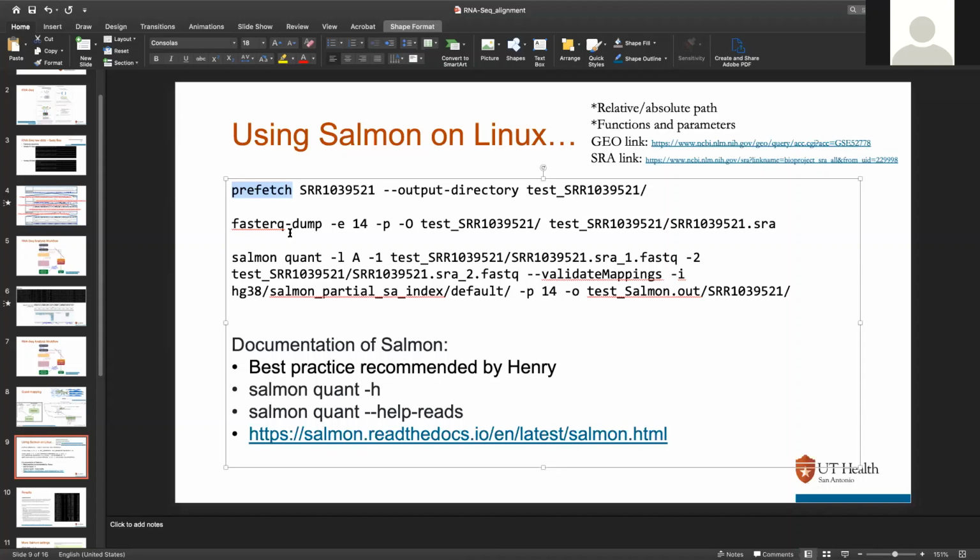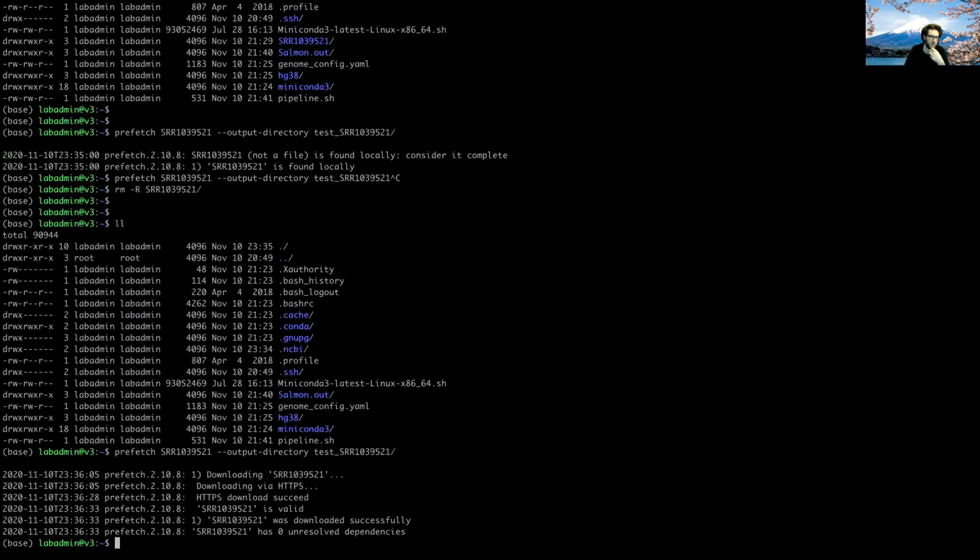Okay, thank you. I'll very briefly mention the way I set up these virtual machines: I use something called Anaconda, or more specifically, Miniconda. Conda is a package management system that can deal with all kinds of packages.